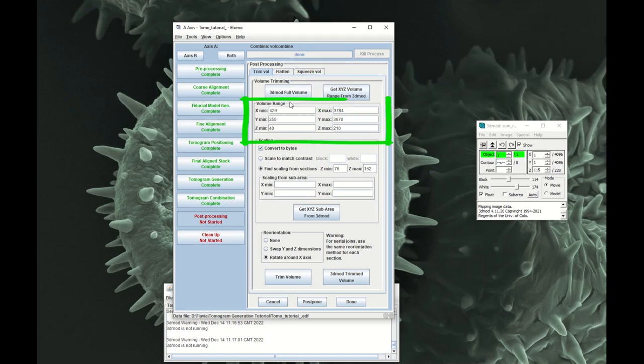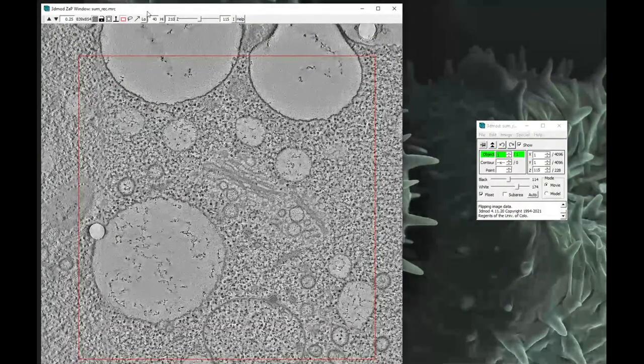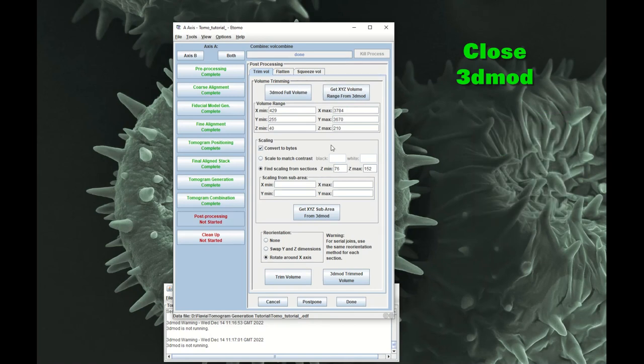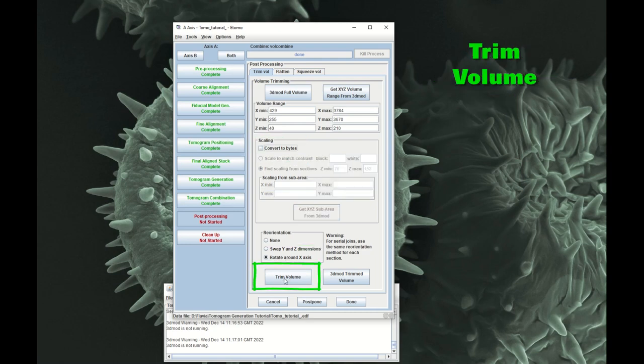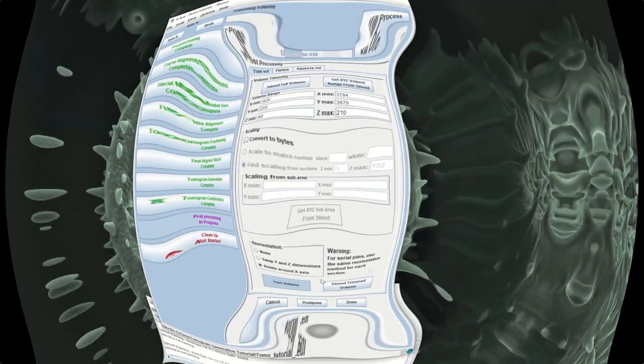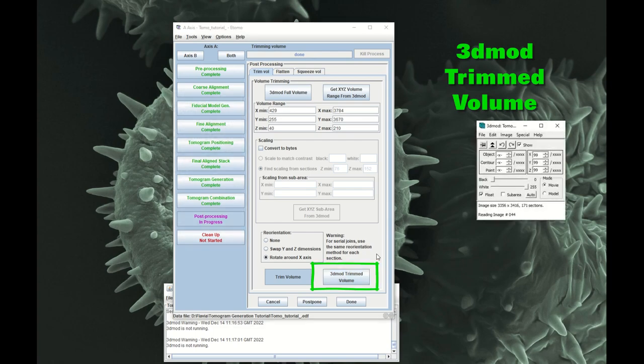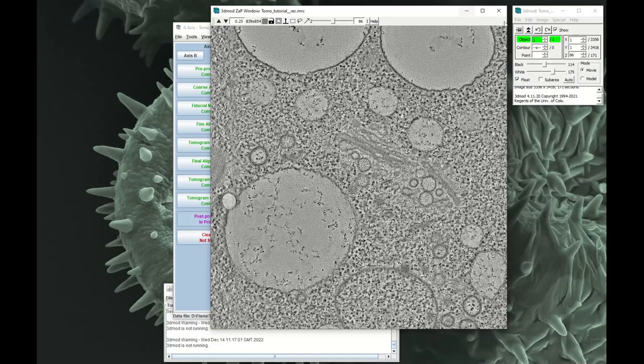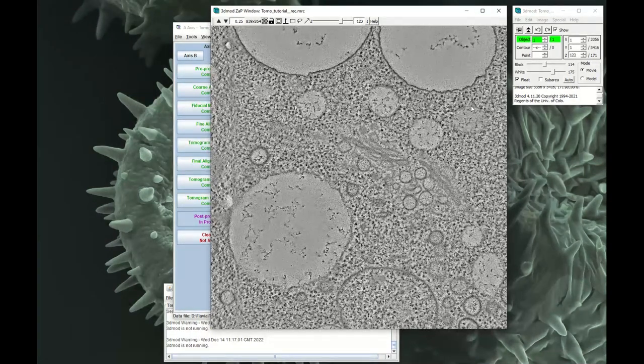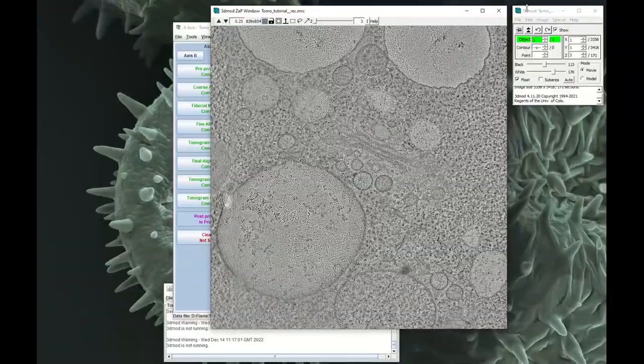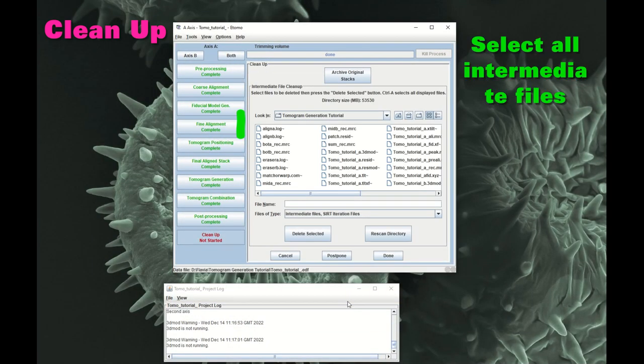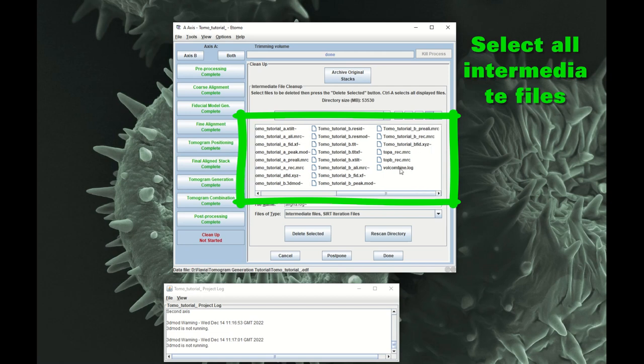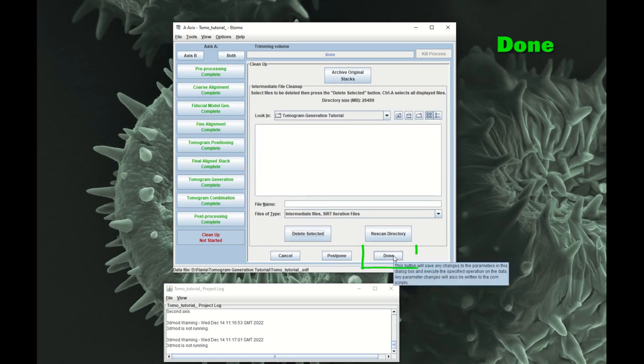So this hopefully, when I trim it, this will give me that trimmed volume, the trimmed volume I have here in 3D Mod. And then rotate around the x-axis, untick Convert to Bites, and then just click on Trim Volume. It's trimmed, you can open the Trim Volume in 3D Mod. So now I've got my Trim Volume, we can have a look at it, it looks ok. Then you click Done, and now just select all of these intermediate files, and you can say Delete Selected, and then you click Done.